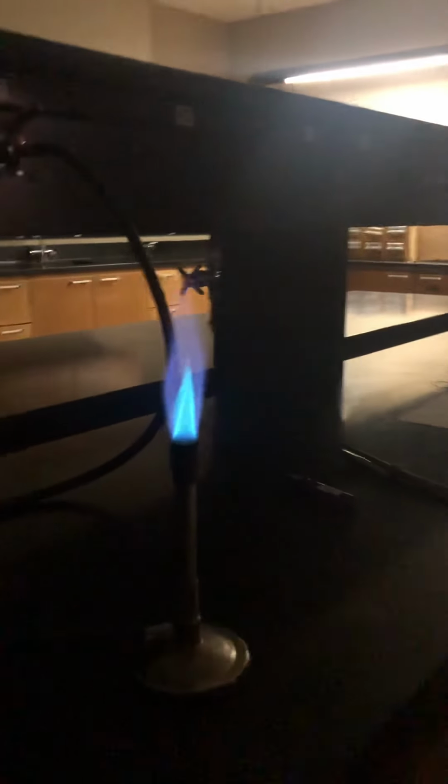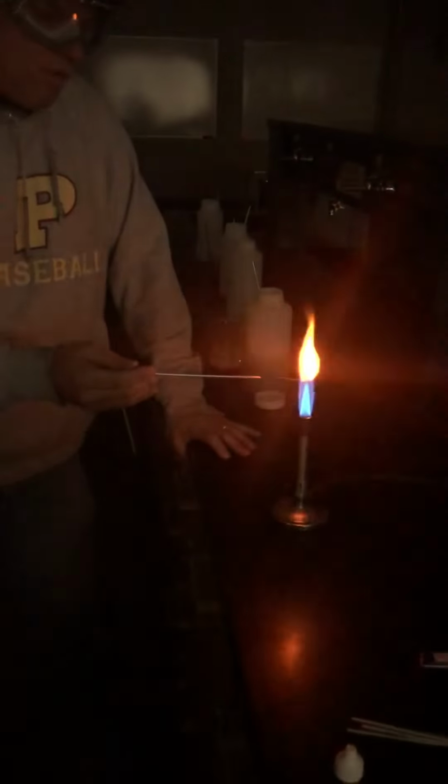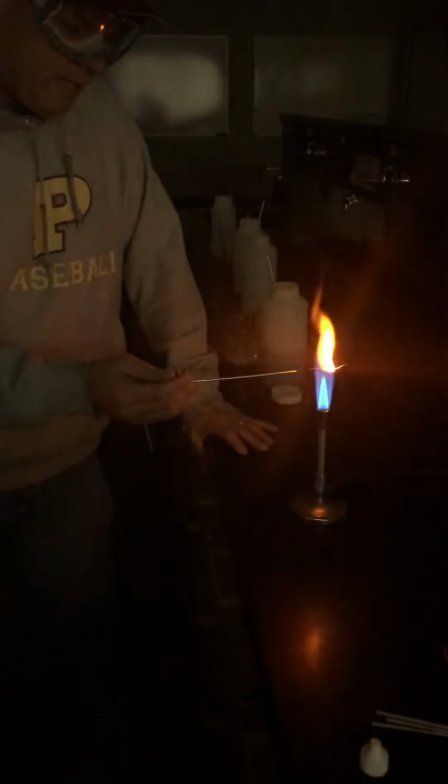So what I'll be doing is I'll be dipping a metal inoculating loop in these solutions, and then I will put it over the flame. Now, this is kind of hard or more difficult than you think, because when I put this inoculating loop, this doesn't have anything in it. It's going to give off a color. Well, let's see what color it gives off. Okay, it gives off whatever you want to call that, yellow, orange.